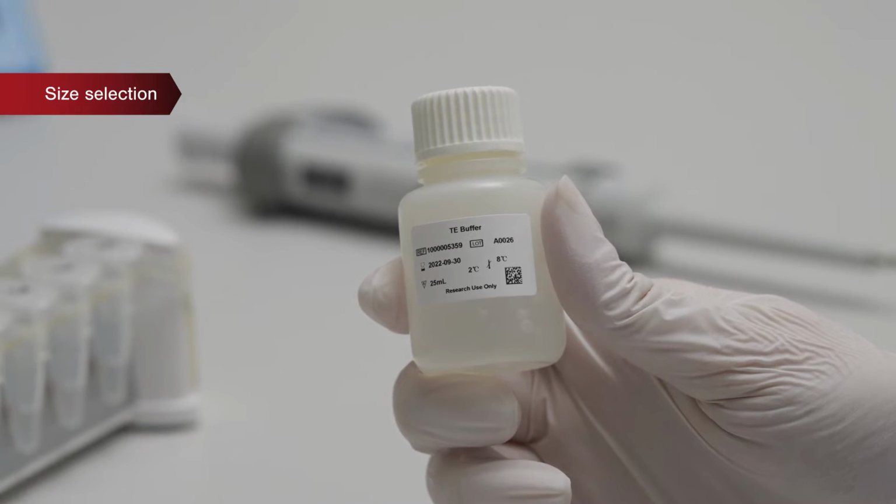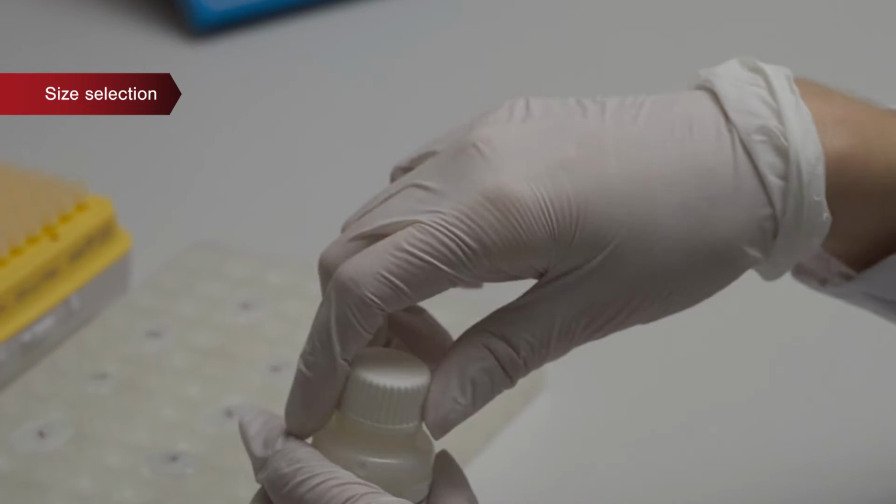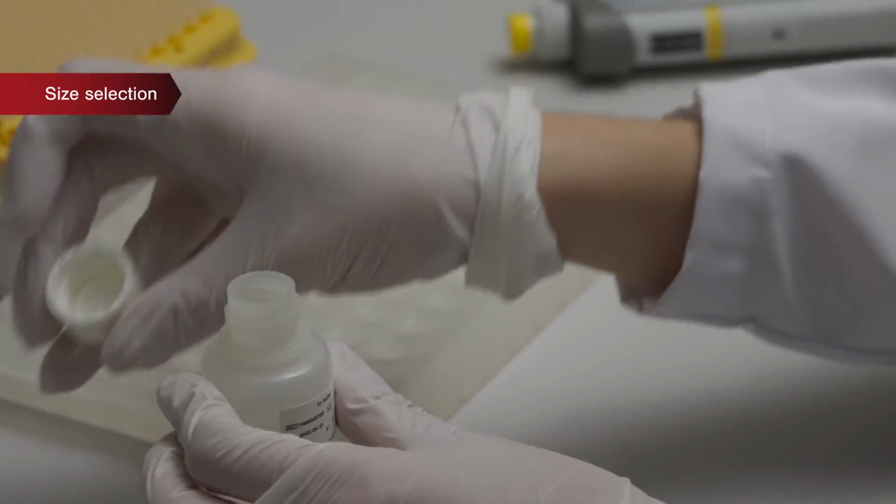We use all 55 microliters of the fragmented DNA sample and dilute it up to 100 microliters in a low bind 1.5 milliliter tube.